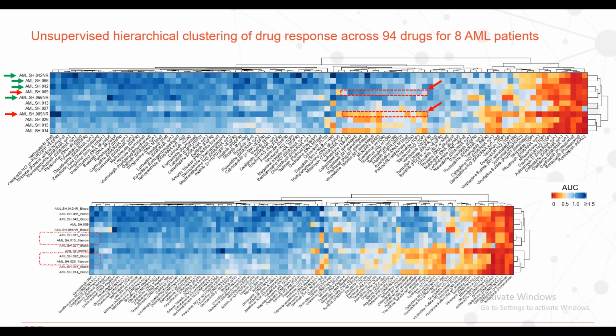And we also noted that for some of these patients, we have the corresponding drug sensitivity data from the blood and marrow samples. And you can see that they usually are very similar, so there is no difference.